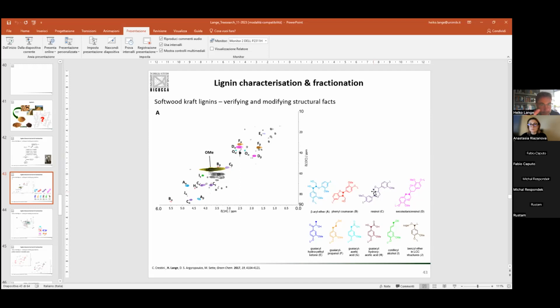Whether the fragments that you see in the mass after ionization, which come up with a certain mass, are really indicating a sequence like ABC or a sequence like AA, BA, etc. Okay, that is really tricky. That is something that people are currently working on.